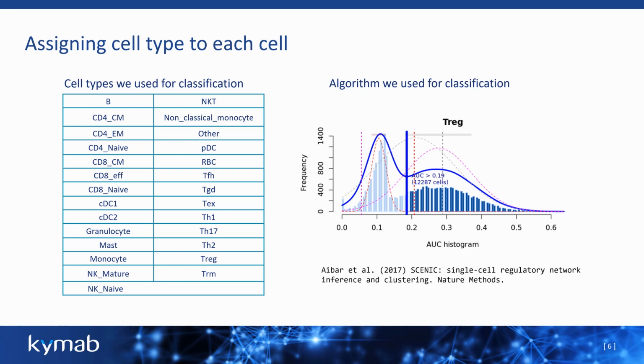Looking at those gene expression profiles, we've used an algorithm that scores the gene expression for each cell out of the 63-odd thousand that we had, and looks for whether it's most likely to be a B cell or a T cell, and it stratifies each individual cell into these 27 bins based on the expression profile. So what that enabled us to do was look at which cell types were present in our data set, but also what their functional properties were.